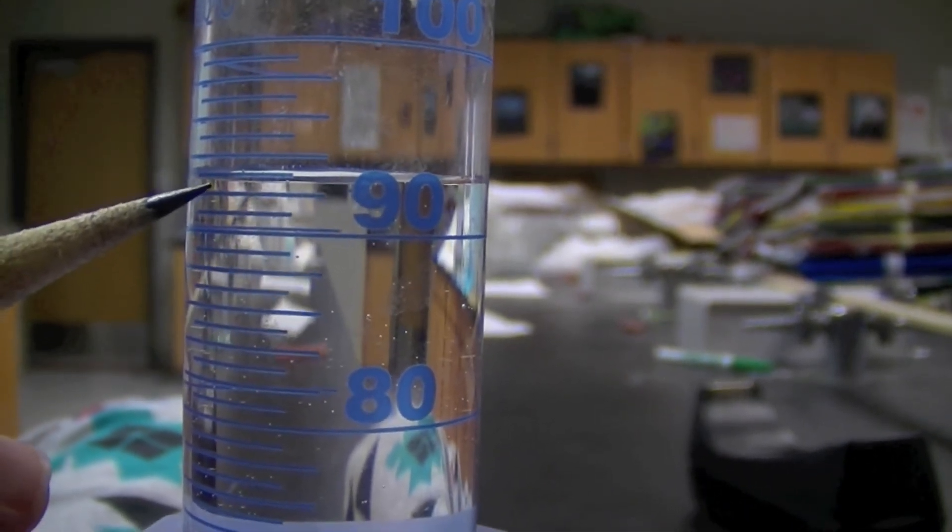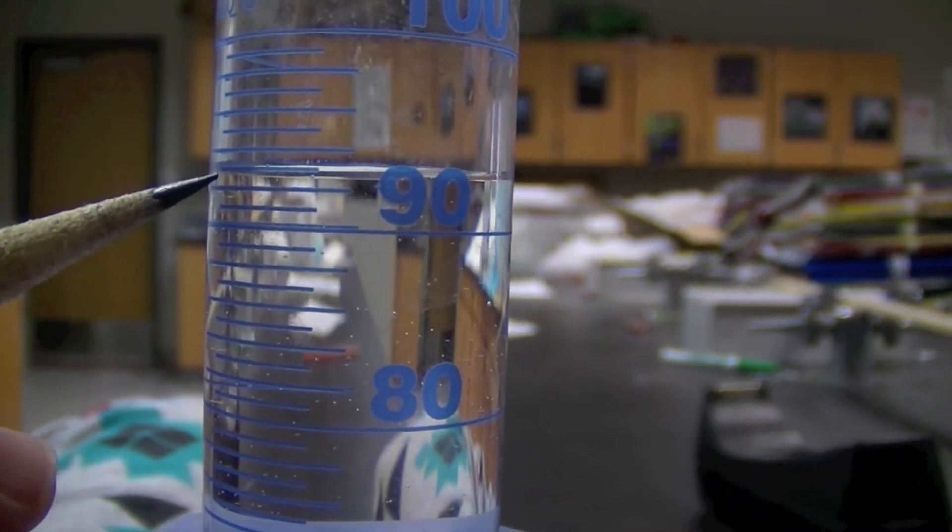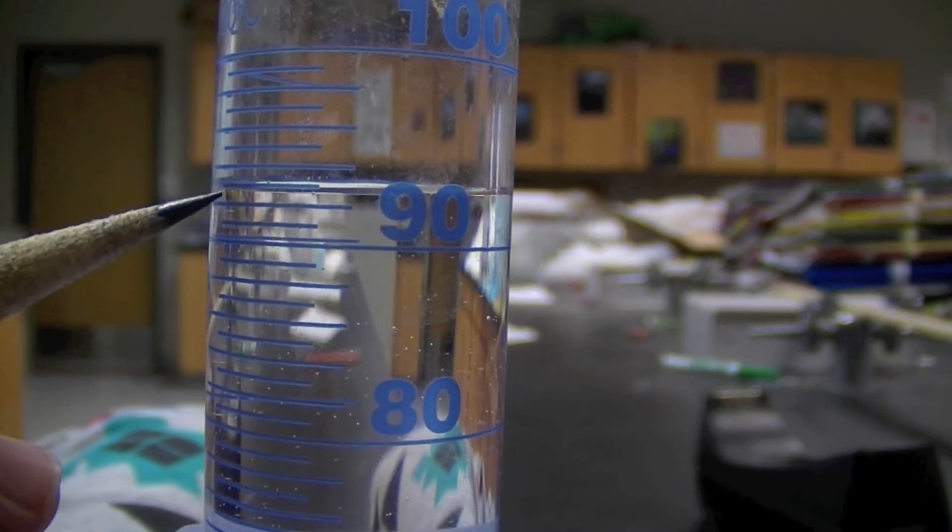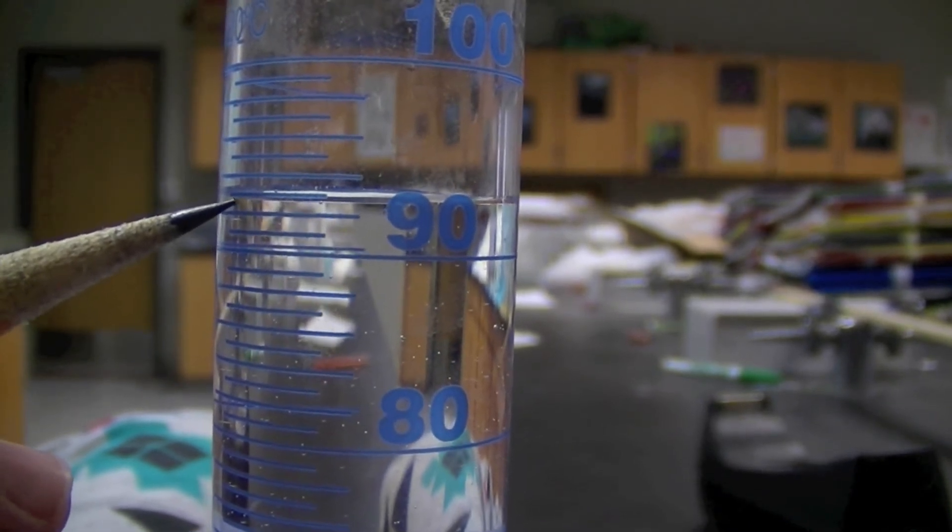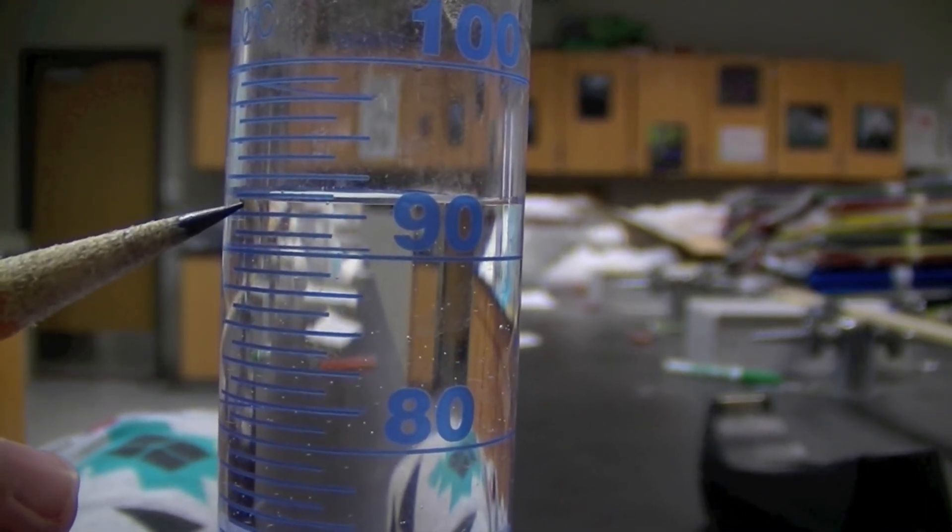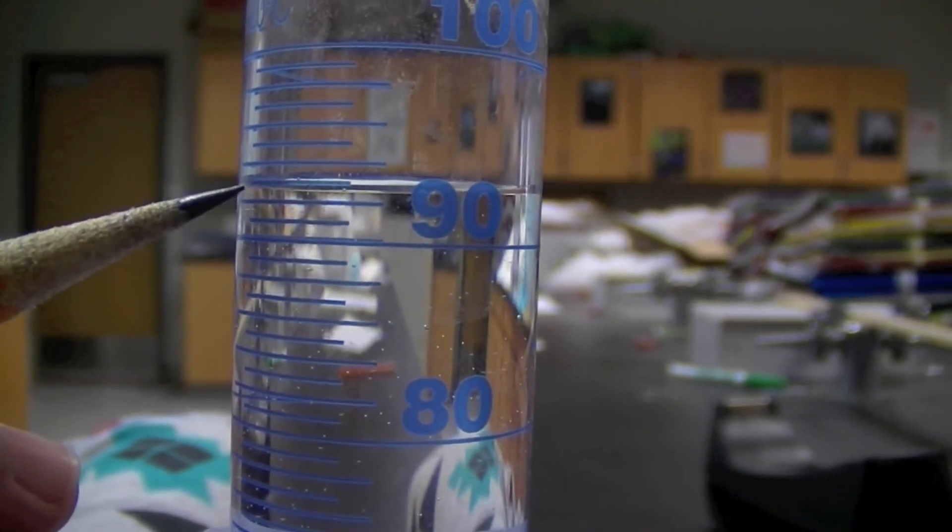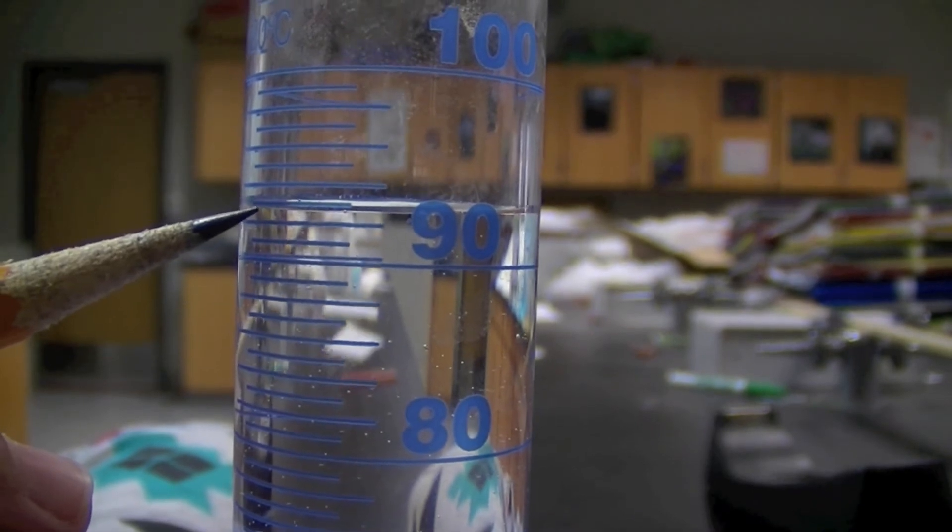Also, we have to make sure that we estimate. So if we're estimating here, it would be 92.8 milliliters from the bottom of that meniscus. We always measure from the bottom of the meniscus, which in this case would be 92.8 milliliters.